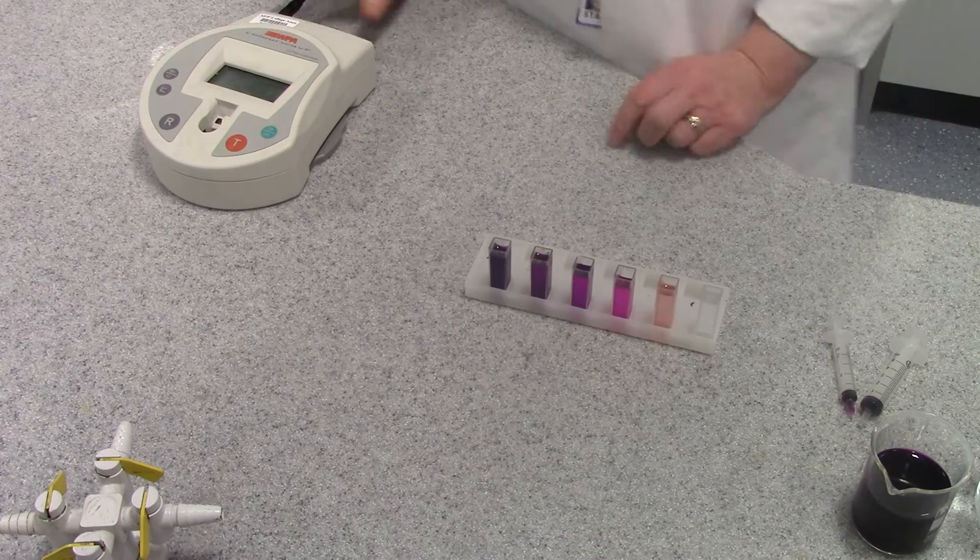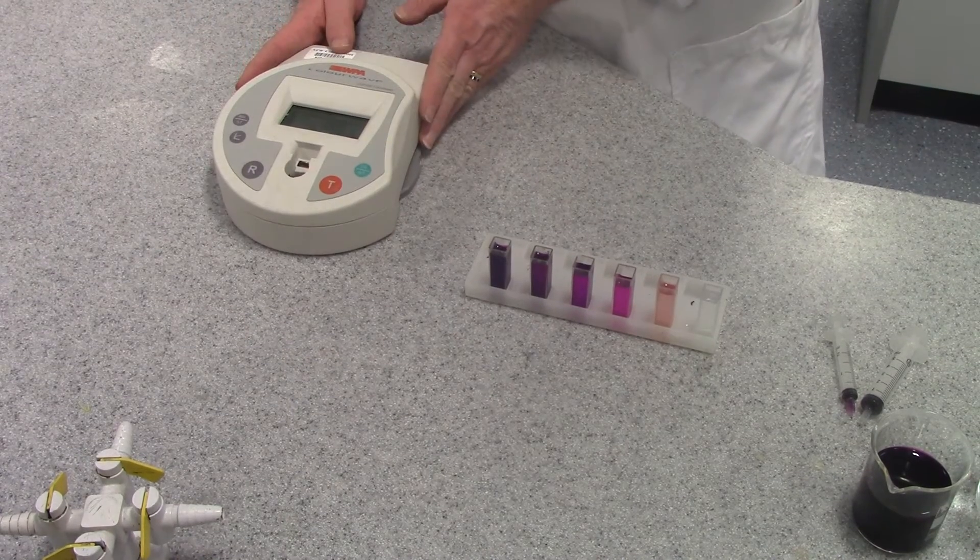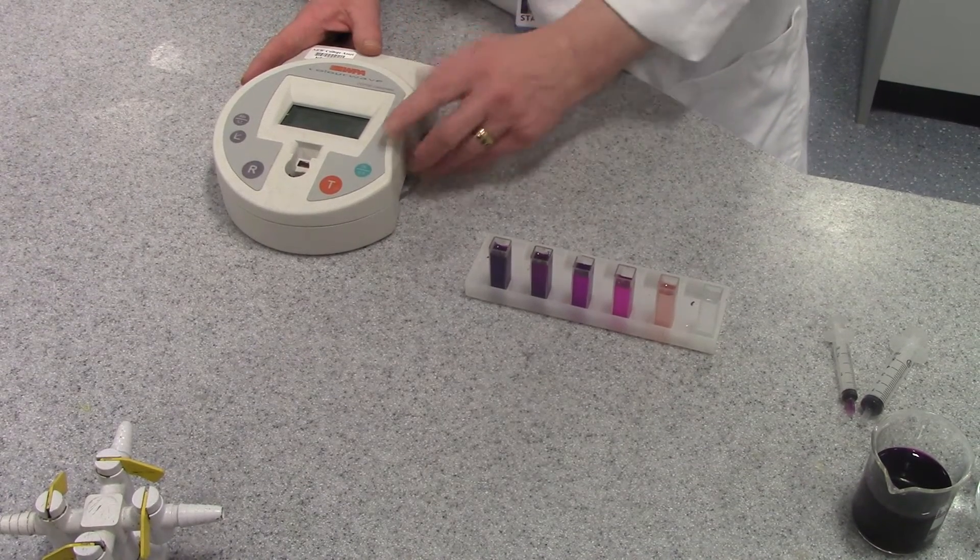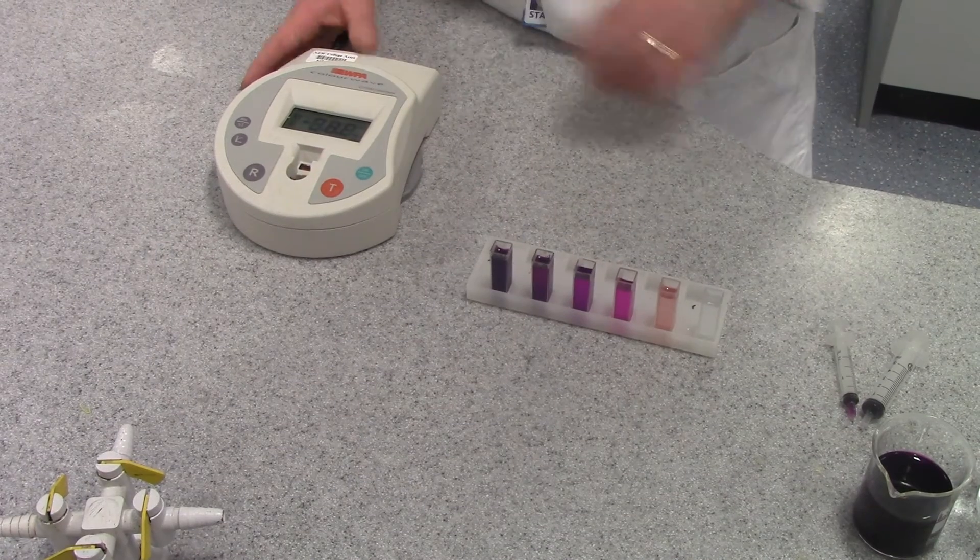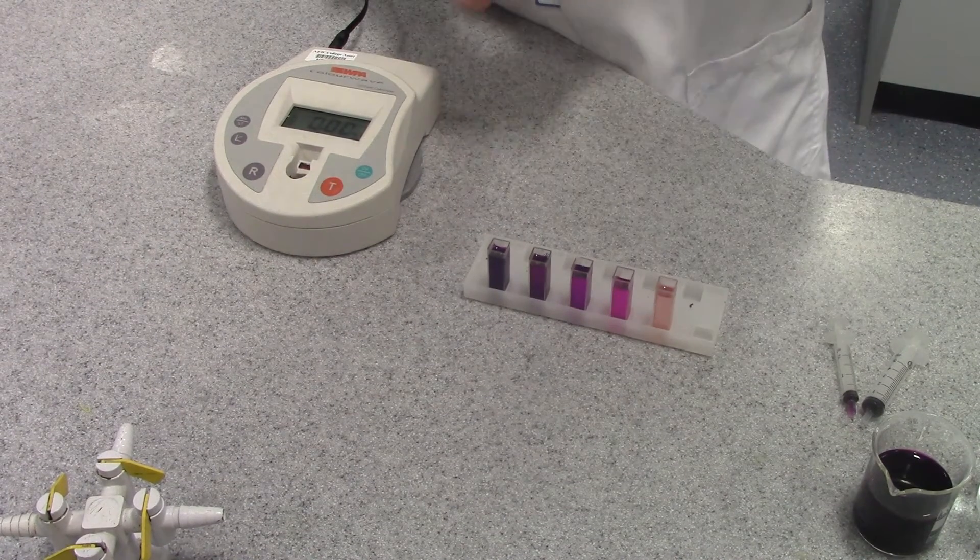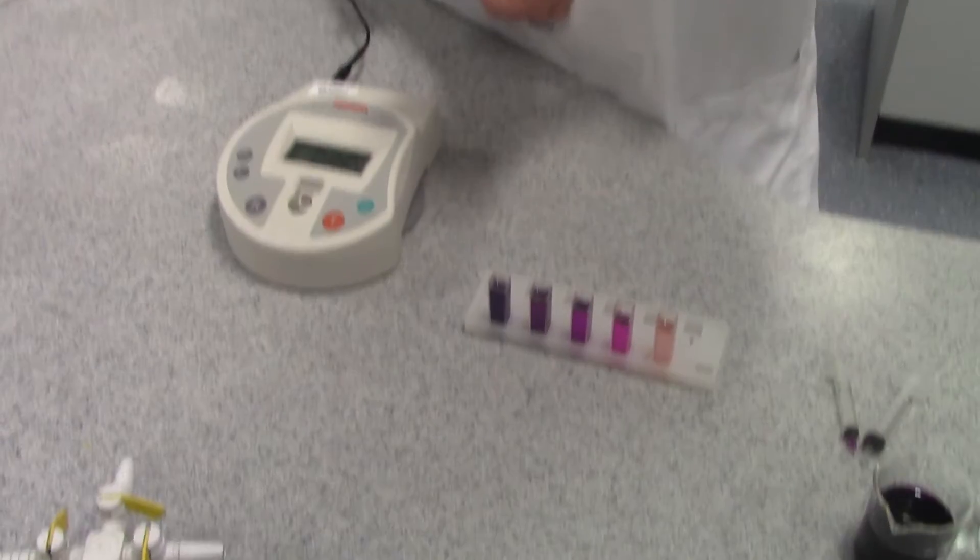When you're using the colorimeter, the first thing I'm going to do is turn it on. The colorimeter uses these special tubes called cuvettes.